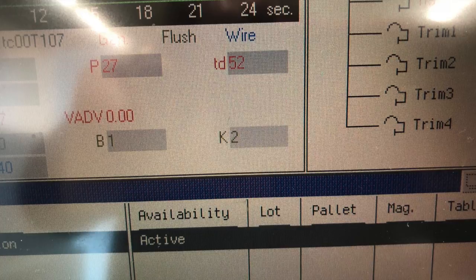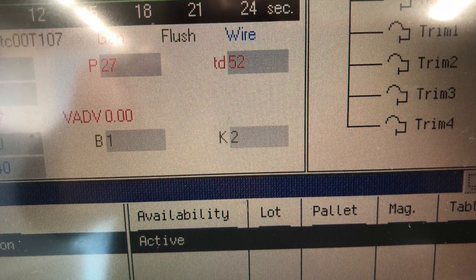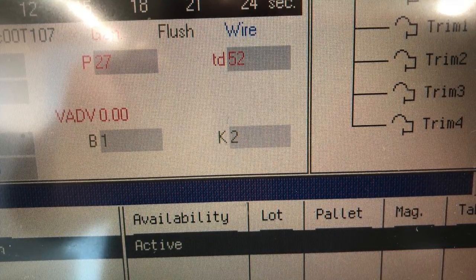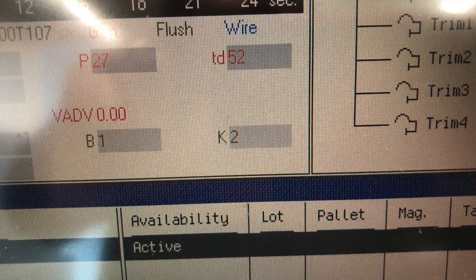Here it is — the conductivity is only two. This is a Swiss machine so they read the conductivity as a K, but that is your conductivity of that machine.